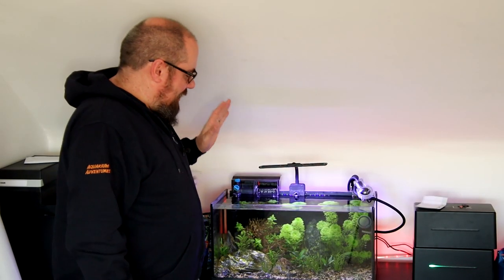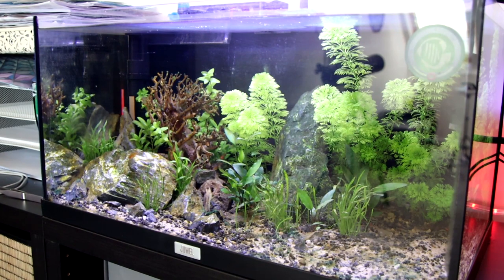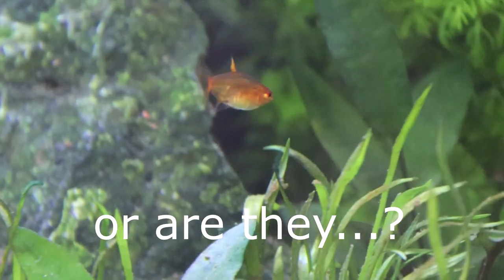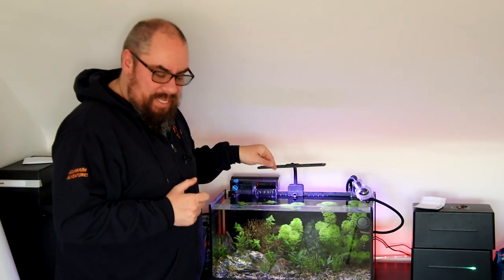I'm going to do my testing against this tank here — my office aquarium. It's a nice little aquarium with fairly light stocking: some chili rasboras and some ember tetras. It's a fairly new tank, so I've been keeping an eye on the water chemistry with all the other tests already, so I can do some comparisons and see how it aligns with the API test or the JBL test.